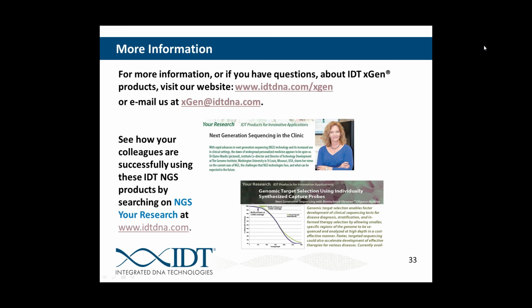And this is generally economical when you get into a very large sample number range. However, if you are only looking to use this assay for, let's say, 2 or 3 samples, it generally is probably not the most economical approach to go to lockdown solution. However, we do have a lot of experience with supplementing. So in that scenario, if you're only working with just a few samples at a time, it might be worth it to follow an array-based synthesis approach from a different provider.